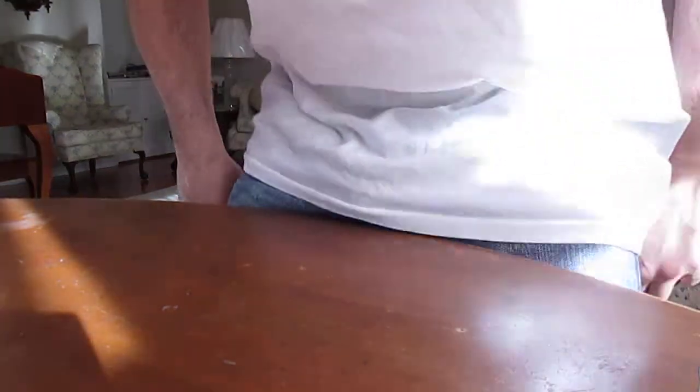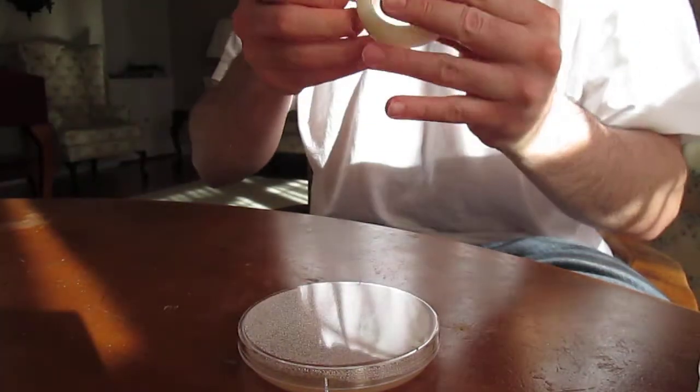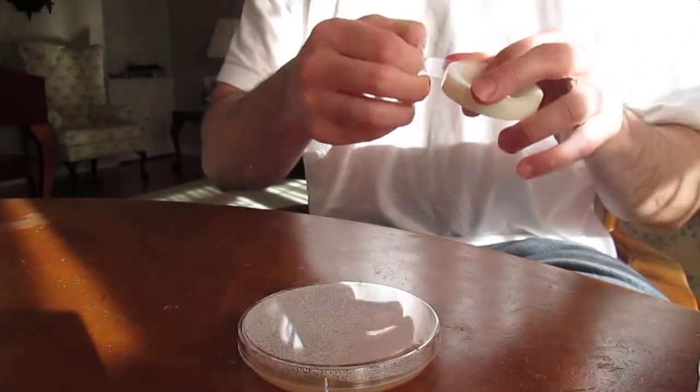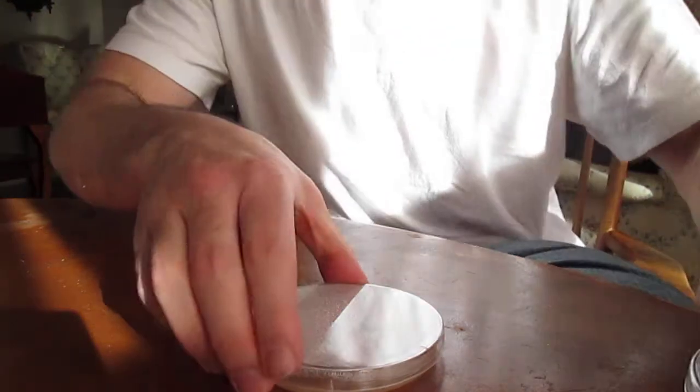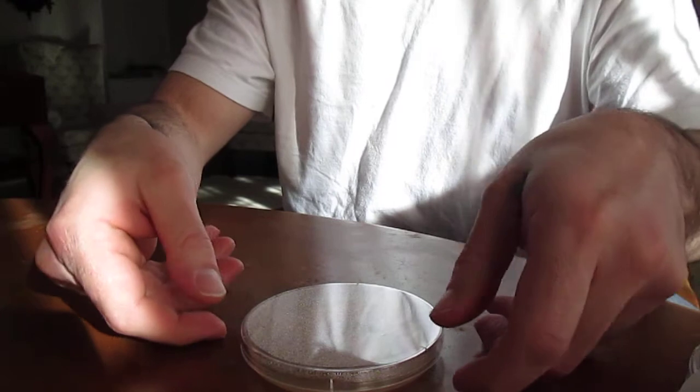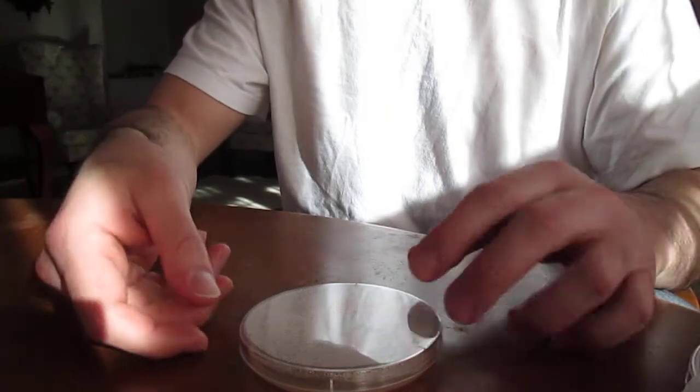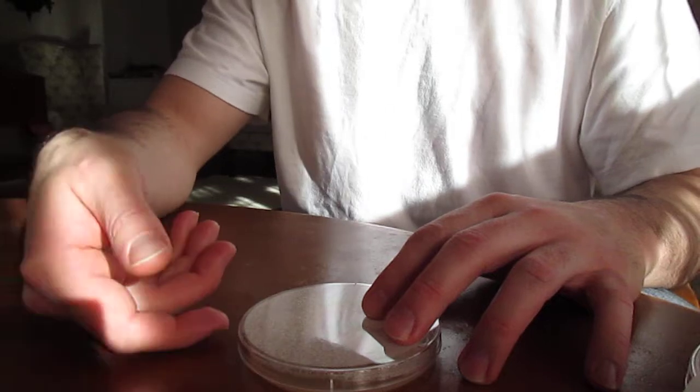Finally, what we're going to do here is apply parafilm around the edges of these petri dishes that are filled with nutrient agar. This is to keep out any kind of contaminants. When you put them in the refrigerator or as they're laying around, anything can just crawl in.